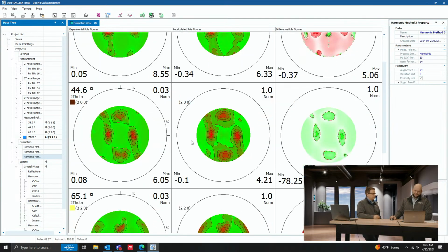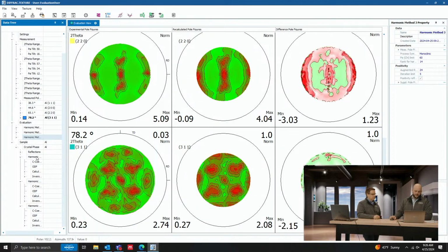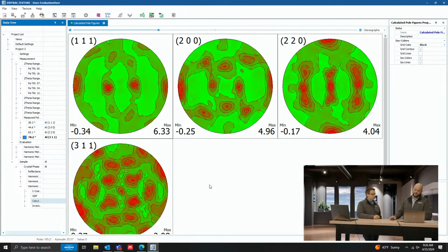Yeah. So now I'm able to fit sharper features. And one of the nice things is if we go down here, we can see what the complete pole figures look like. One thing I always watch out for is on the edges here: if you're overfitting, you'll see these weird oscillations, little lines or divots. Just be thoughtful, that's probably not a real thing.